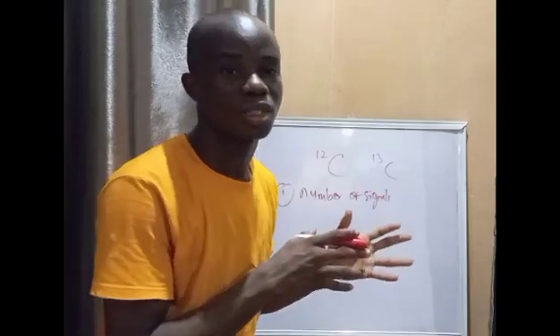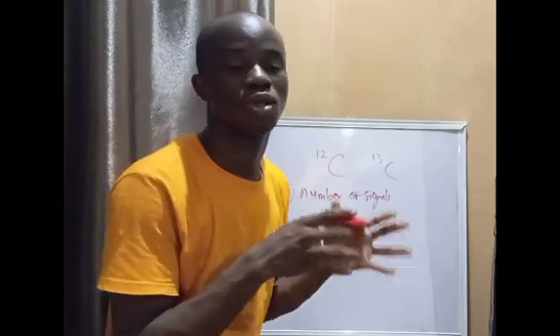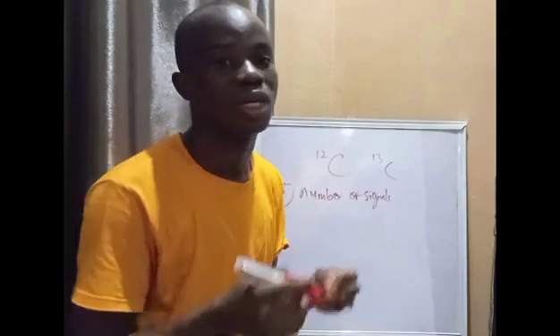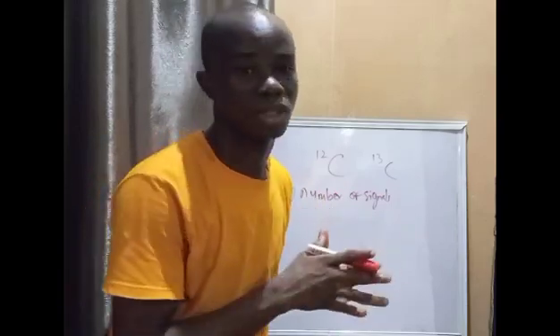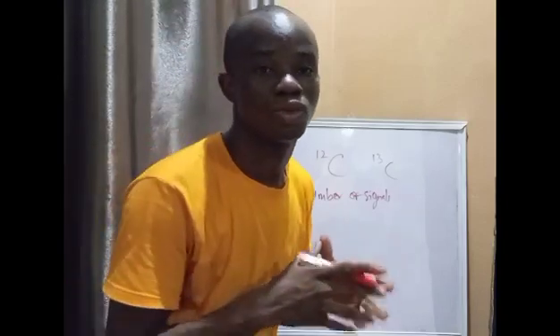Like I said, different signals imply different kinds of hydrogen. So the chemical environment of each of these protons can be known from their chemical shift. Different protons have different values for their chemical shift.